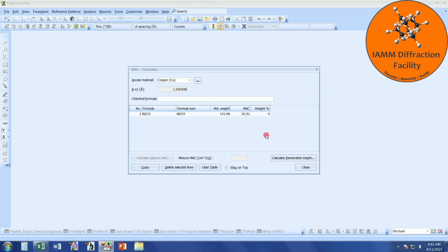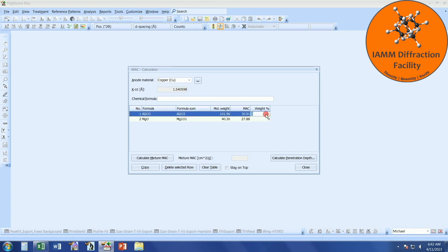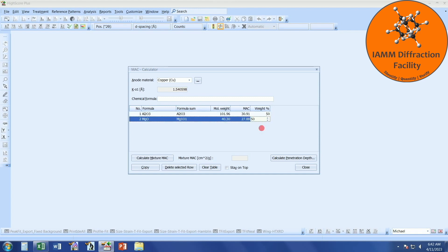You'll also notice here in the weight percent it might say 0, but it just assumes that it is 100% because we only have one row of items. It wouldn't really make sense for it to think it was 0 or any other value than 100. If we had some sort of mixture — say, aluminum oxide and magnesium oxide powders — I could type that in, hit Tab, and enter whatever weight percent of each I wanted, say a 50-50 mixture. I can then come down to this button, click it, and there is the mass absorption coefficient of the sample.